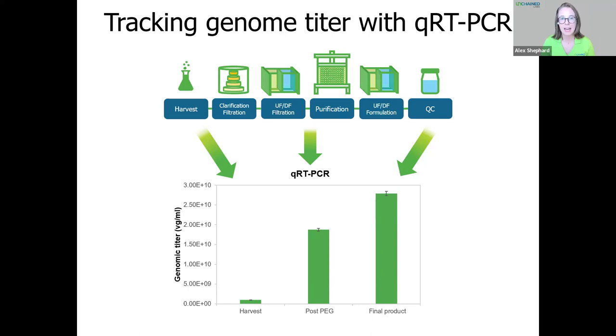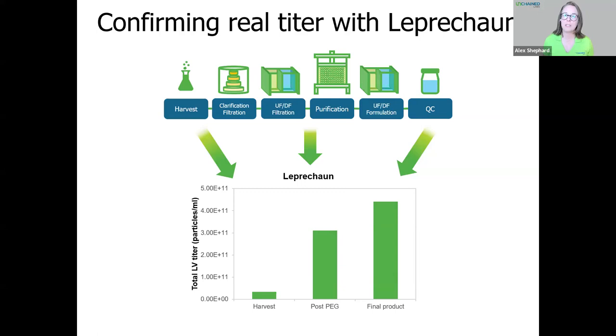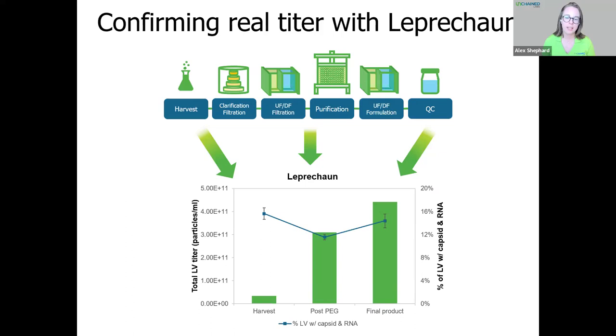However, if we run these samples on Leprechaun, we can see that the story is slightly more complex. So if we just look at the total lenti titer on Leprechaun, which is all VSVG particles that are the correct size, we see a similar trajectory. However, if we focus in on the capsid and RNA-containing lenti, indicated by the blue line here, then we can see that actually the proportion of this is no higher in the final product than it is at harvest, about 15 to 16% of total particles in this instance, in each case.